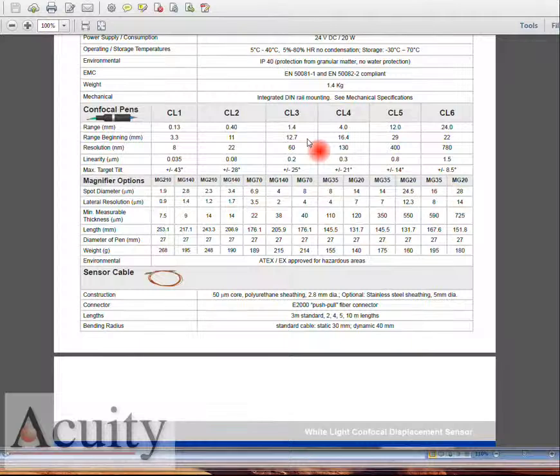12.7 millimeters out to about 14 millimeters. We're going to have a resolution of 60 nanometers and a linearity of plus or minus 200 nanometers, very accurate. It's got a big angle, plus or minus 25 degrees. That's the probe that we use to measure it.